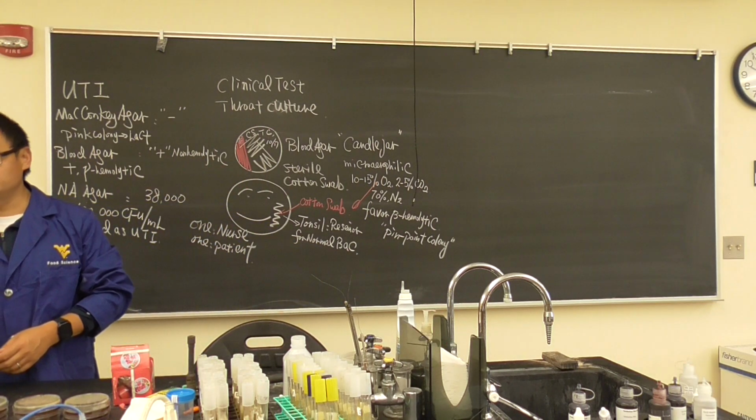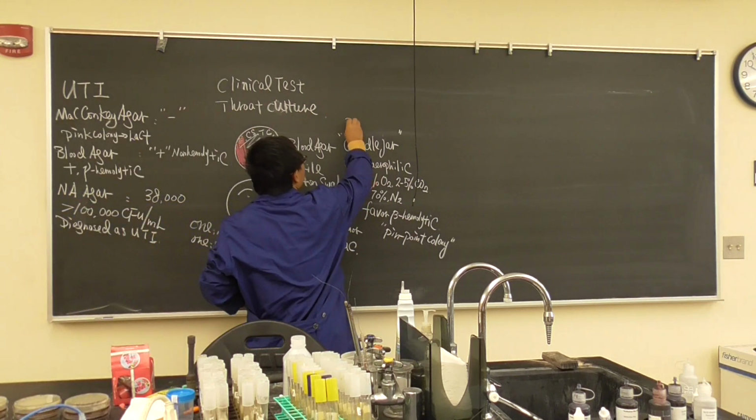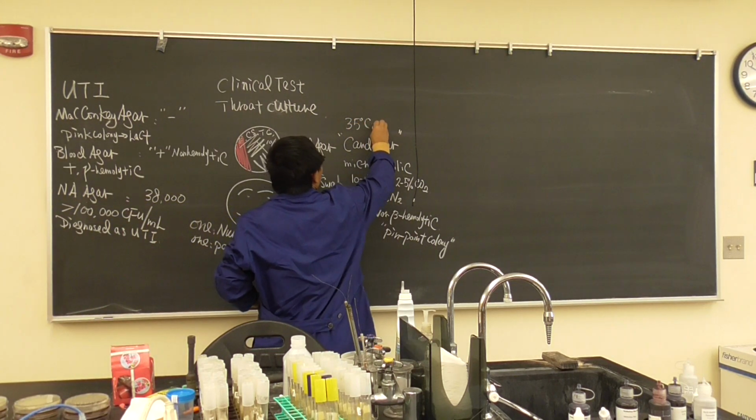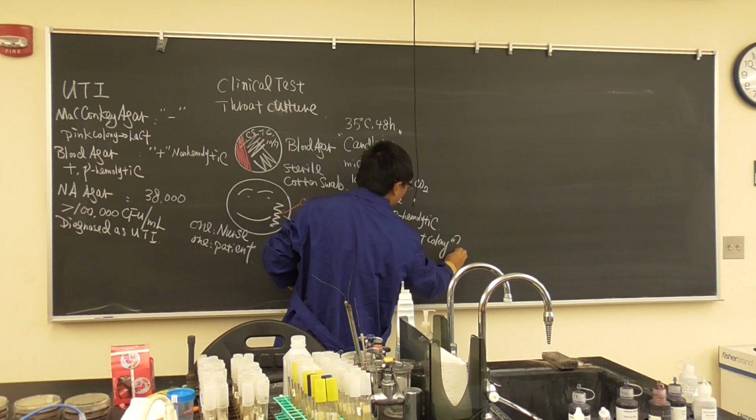And Thursday is exactly the time after 48 hours. At 35 degrees Celsius, 48 hours, we will see the pinpoint colony. Okay?